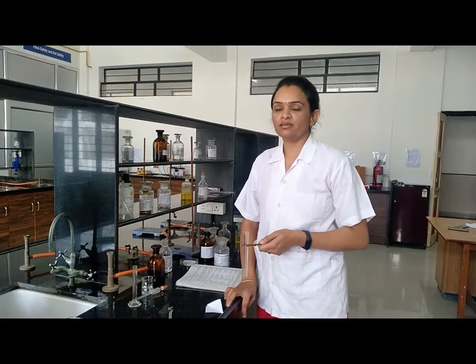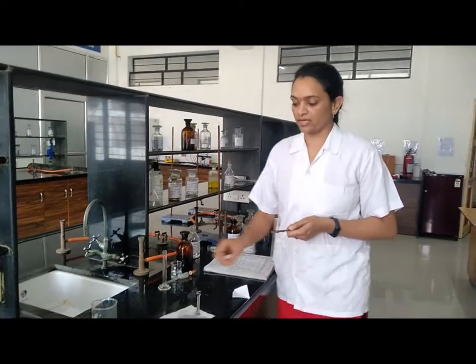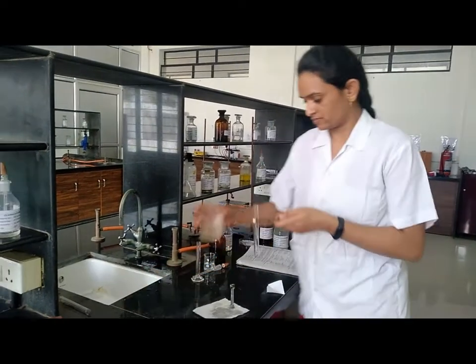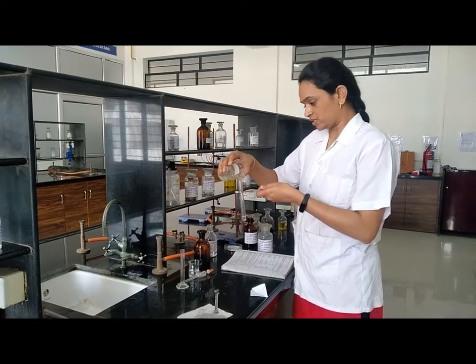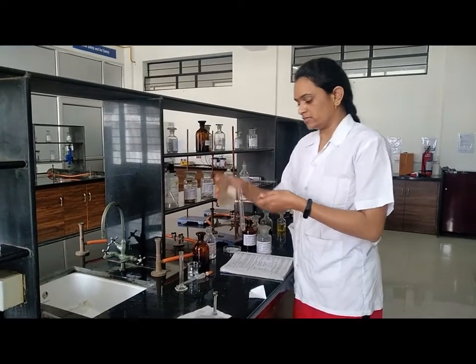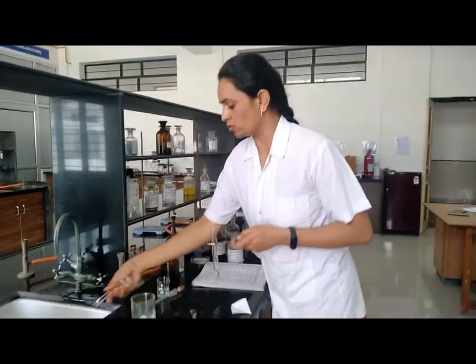Now start with test B. We have to collect the filtrate in test A. To this filtrate, which is obtained from test A, add 3 ml of alcohol.